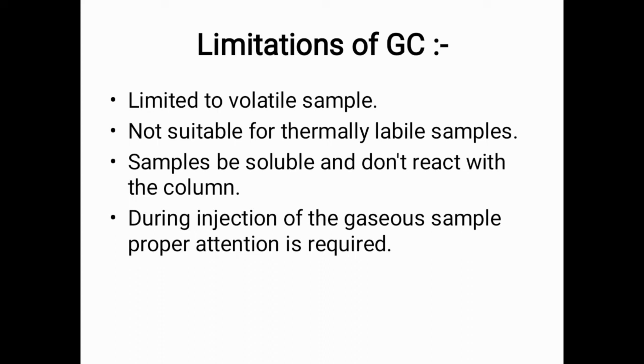The limitations of gas chromatography are: it is limited to volatile samples, it is not suitable for thermally labile samples, and samples should be soluble and not react with the column. During injection of a gaseous sample, proper attention is required.